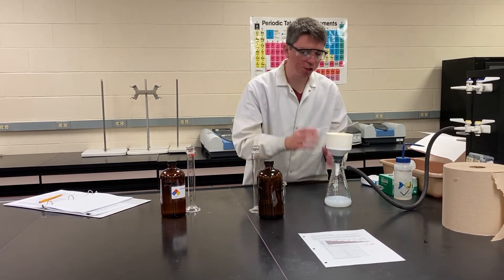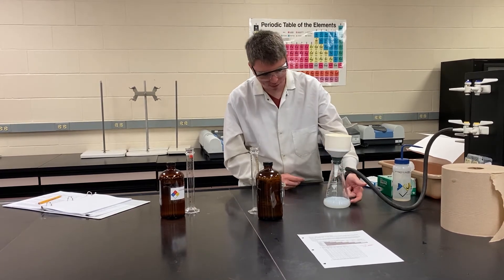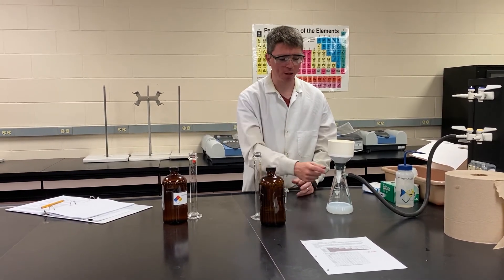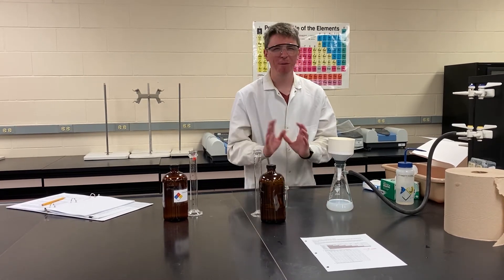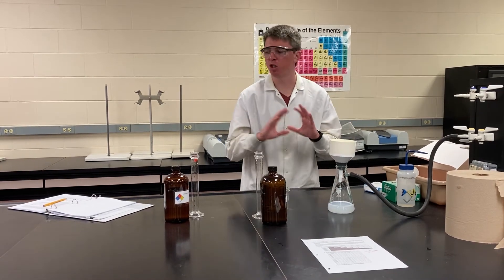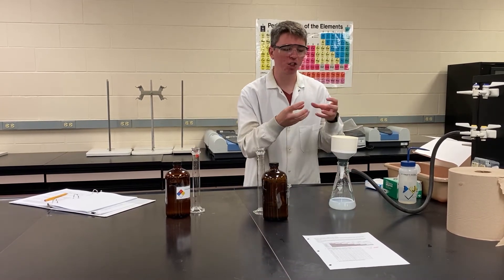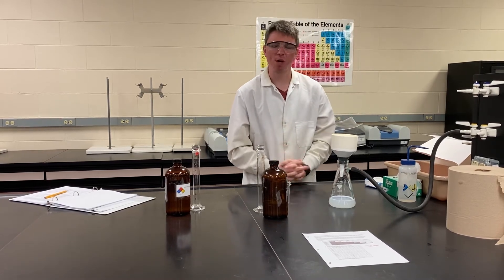We're going to let this filter through for about 20 minutes. We have gotten some of our precipitate down here in the flask. If we really want to be analytically correct, we can filter this multiple times until we recover all of it. But for the purposes of this class and this experiment, what we have up here is enough to do the math with. It's already pulled most of the water through, but we want to keep pulling any water stuck inside that solid out, so we're going to leave it on for about 20 minutes.